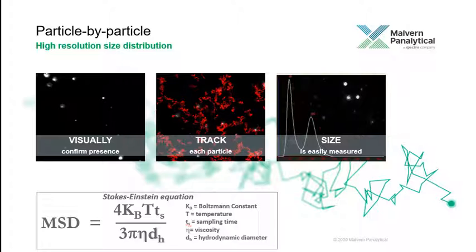Particles suspended in media are constantly and randomly moving due to Brownian motions and scatter the light when exposed to the illumination source. This is directly observed and recorded in the nanoparticle tracking analysis software, so-called NTA. The NTA software identifies particles in the image and applies algorithms to track their movements. All particles are individually and simultaneously measured to generate particle diffusion over time. Then, the Stokes-Einstein equation is used to convert particle diffusion into size.